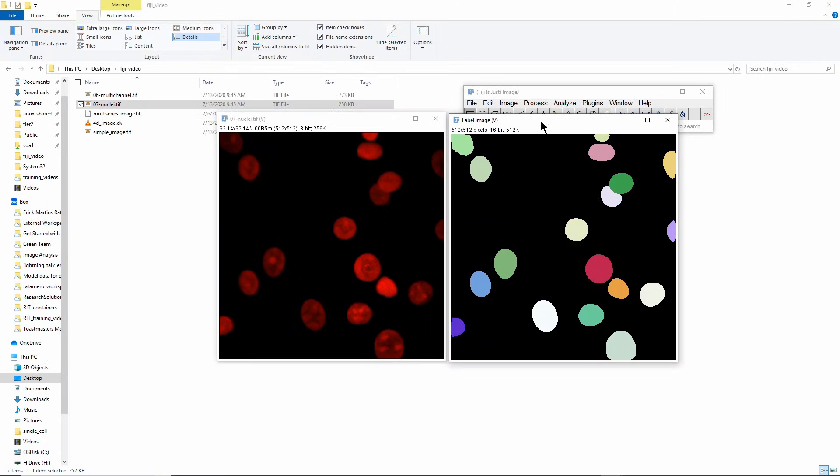StarDist does a pretty good job on most fluorescent images, so I definitely recommend at least giving it a try. Sometimes you need to tweak the parameters a little bit to find what works for your images, but in general it's really good.